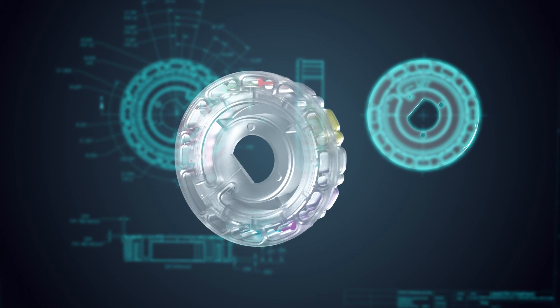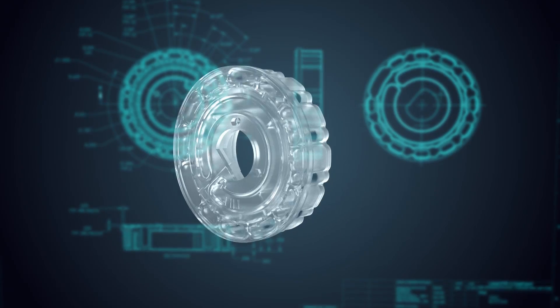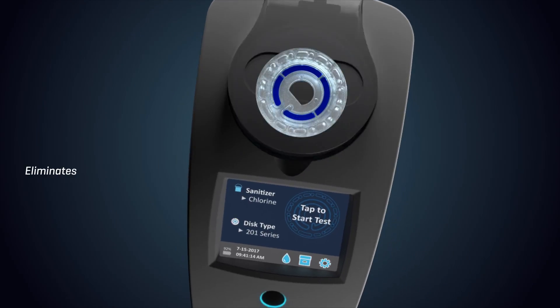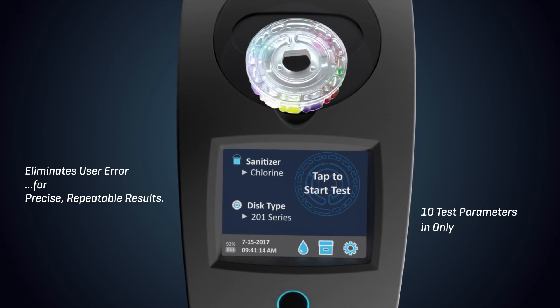Reagents are dispensed into specially designed wells, mixing beads are inserted and the disk is sealed. The unique fluidics disk eliminates user error for precise, repeatable results in just 60 seconds.